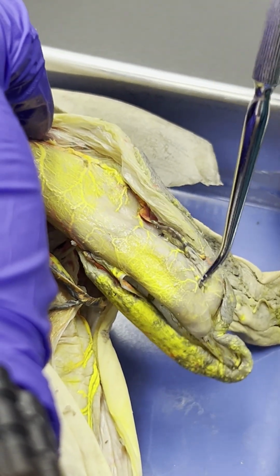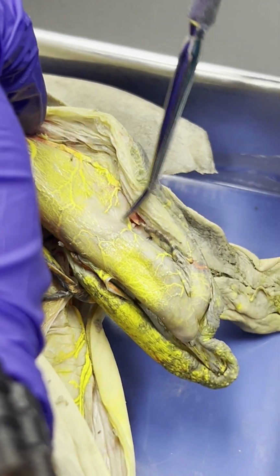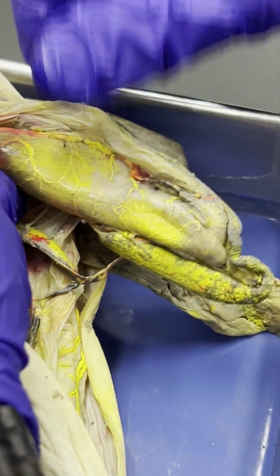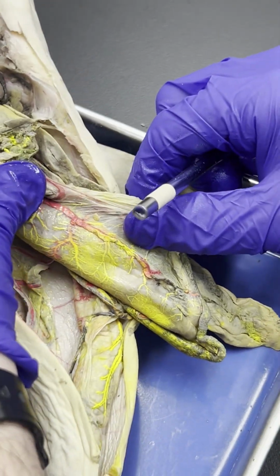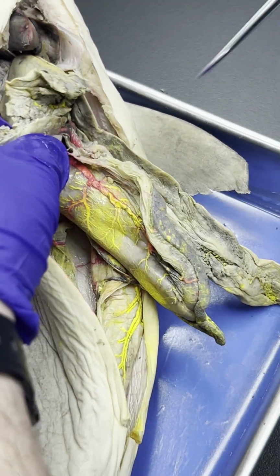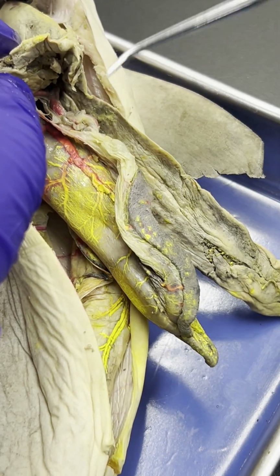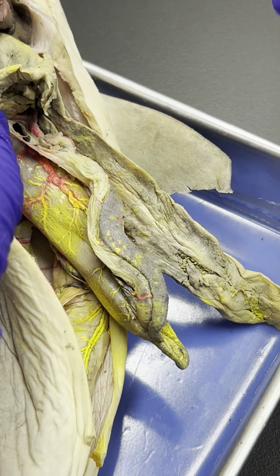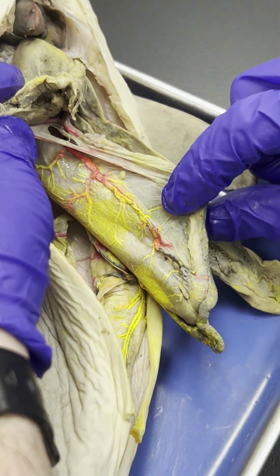So the greater curvature of the stomach is the outside of the stomach right here. And then the lesser curvature of the stomach is more or less going to be inside the greater curvature. A structure that I'm not going to show you in this video, but it's kind of fun, in my opinion, to see when you're doing the lab, is the rugae of the stomach. To me, they look like little sea anemones in the shark's stomach, but we'll ask you guys to cut the stomach open, and you'll see the internal folds of the stomach, which are the rugae. It helps break down the bolus and digest it a little bit faster because it's increasing the surface area of the stomach. These are all things that we'll go over in lecture.